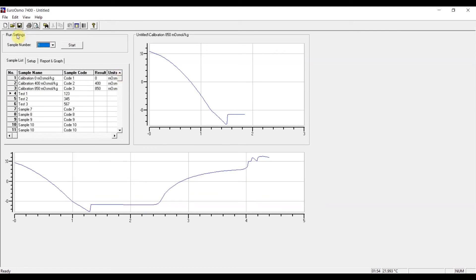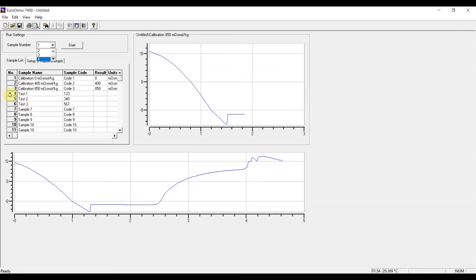In the run settings window, you have the possibility to directly choose the sample according to the sample number, so column one, which is going to be measured next. And in this row, the results are going to be overwritten.